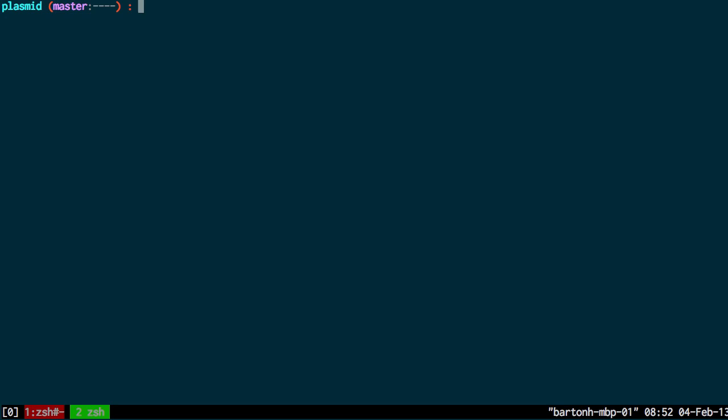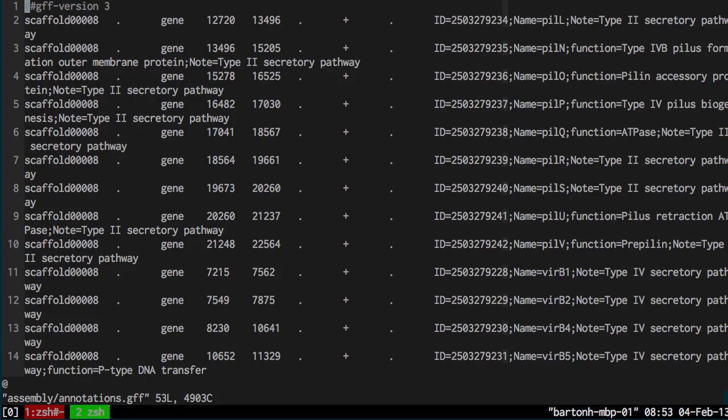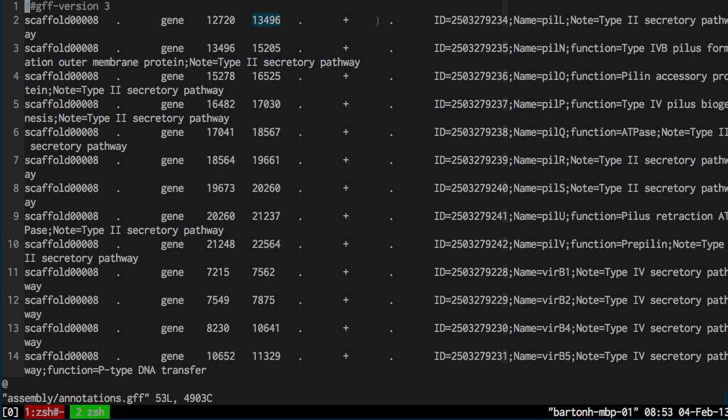After generating the FASTA sequence I'll now want to generate the annotations. The annotations I've stored in an annotations.gff file. You can see these are the annotations for scaffold 8. They're gene annotations and you have a start and end position for these annotations on that sequence. You have the strand, the id, the name, note and function where applicable.